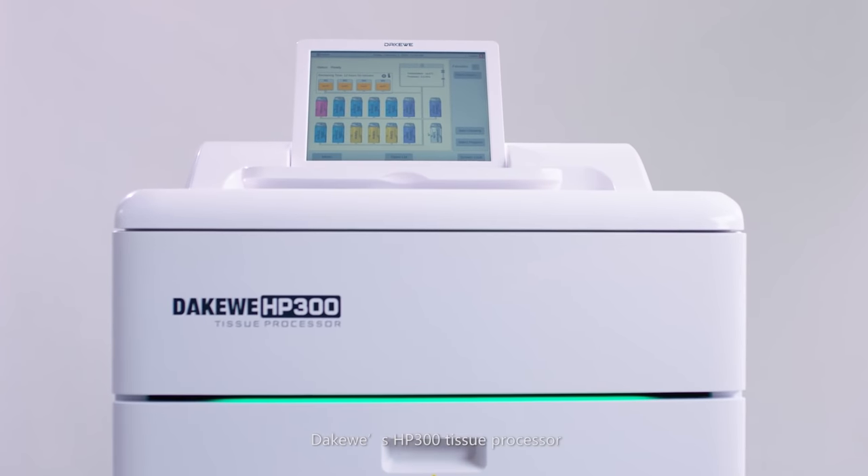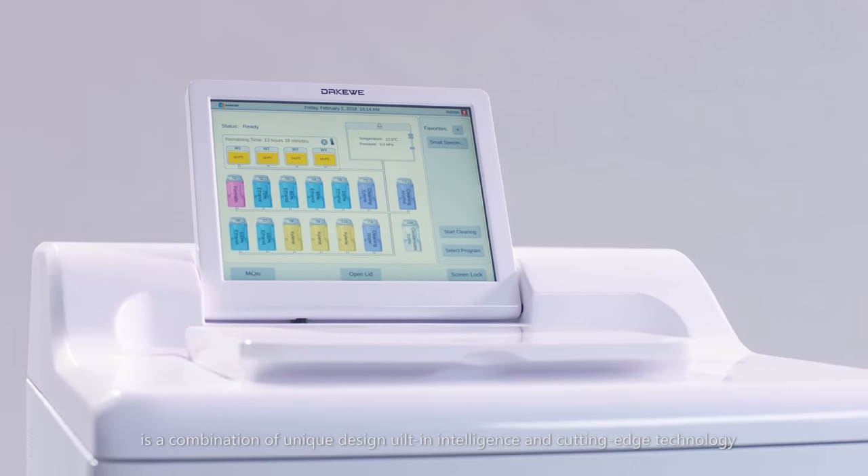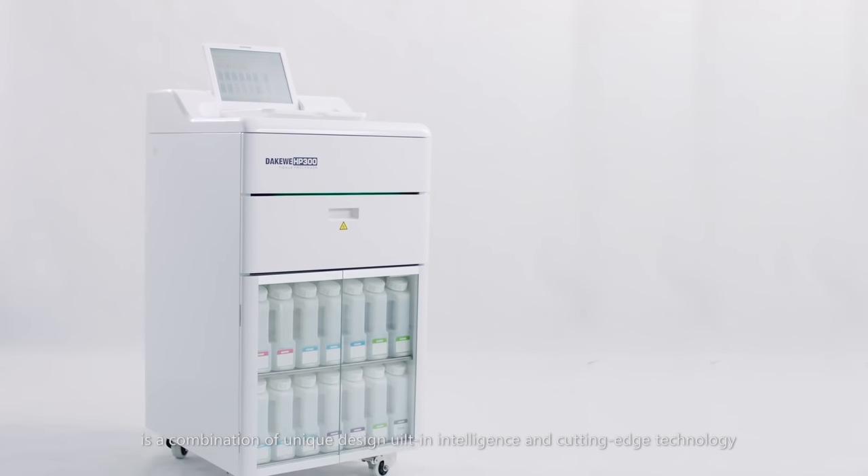Dakewe's HP300 Tissue Processor is a combination of unique design, built-in intelligence and cutting-edge technology.